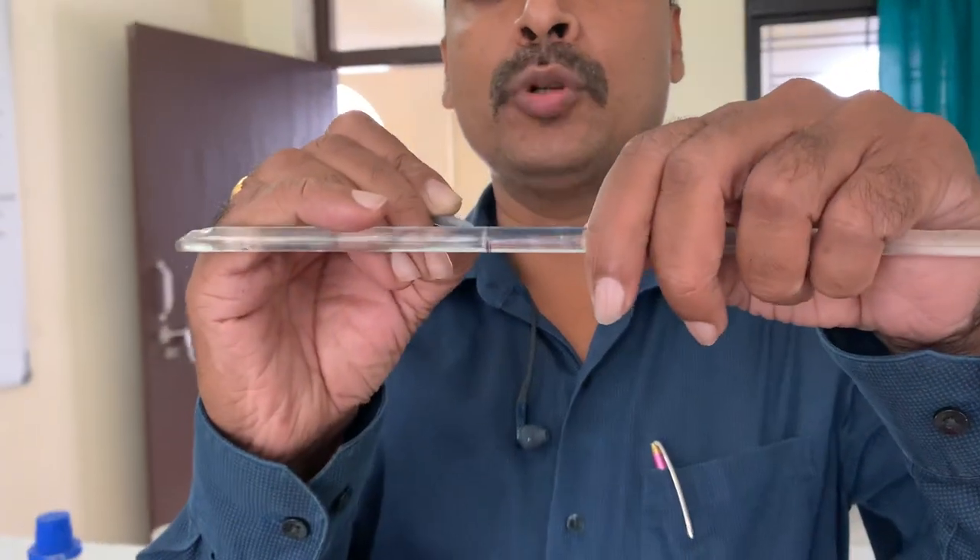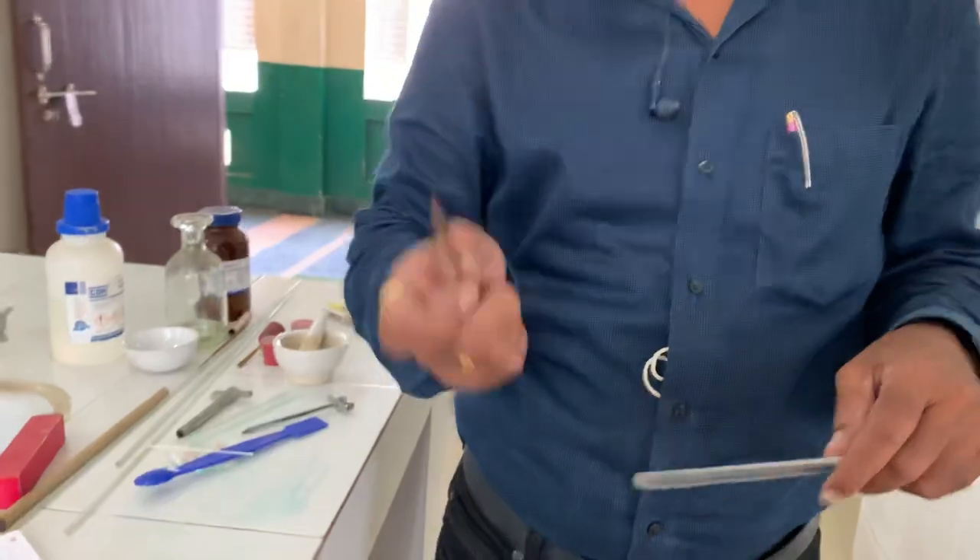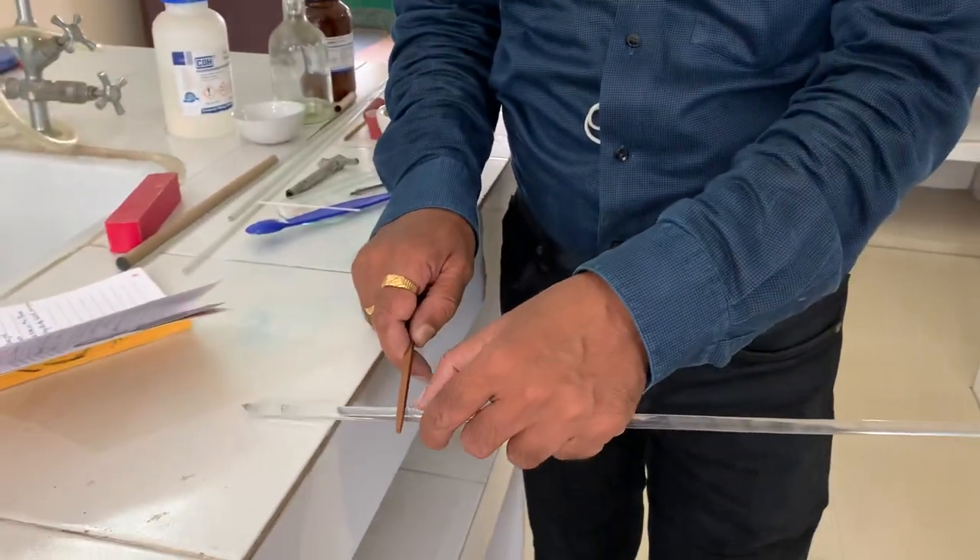If you mark with your marker pen, then it will be easy. Then again, you take the triangular file and scratch the glass rod at the marked position.